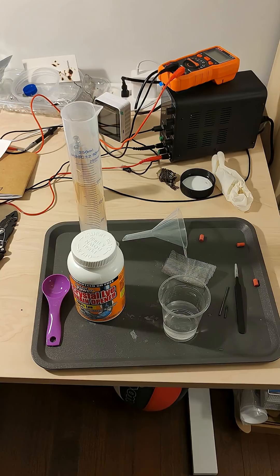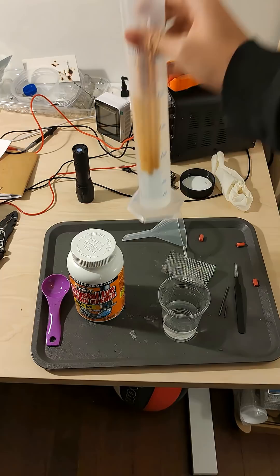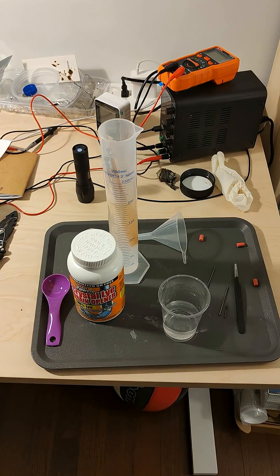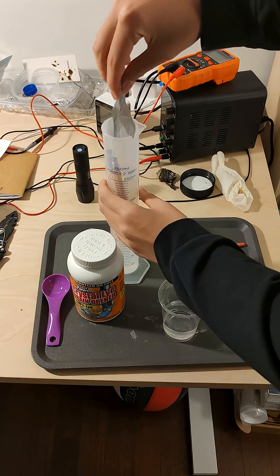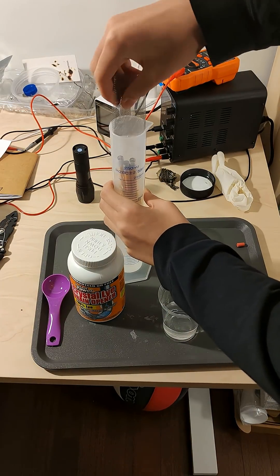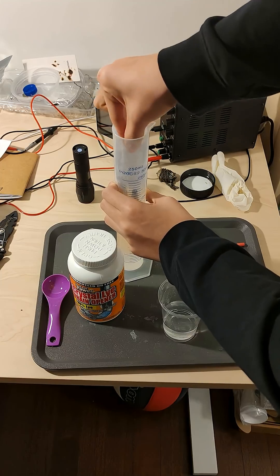Okay, now we have arrived at complication number one: they float. So you can simply cut out a piece of mesh or something and then press it all down. It works surprisingly well.